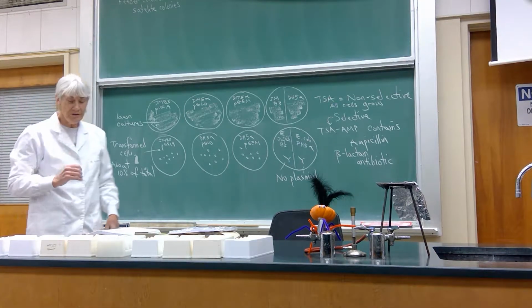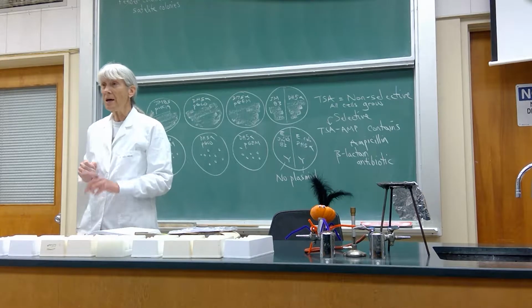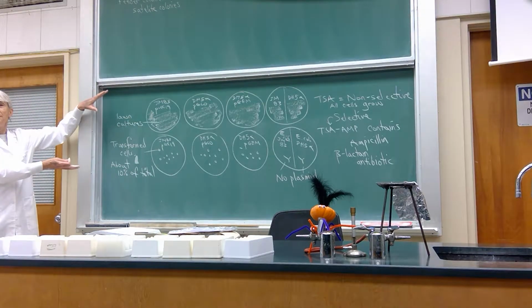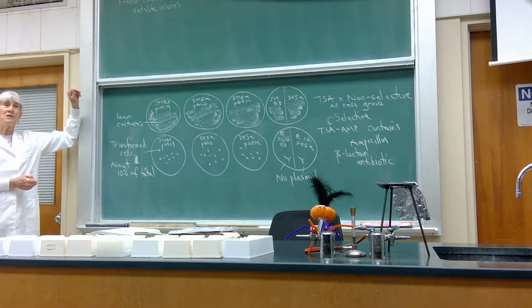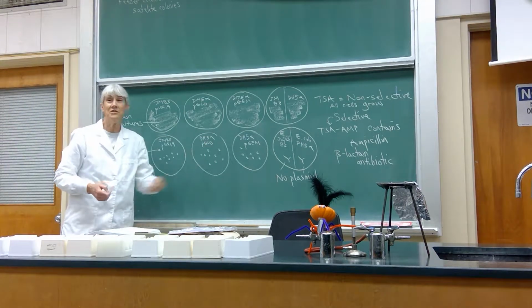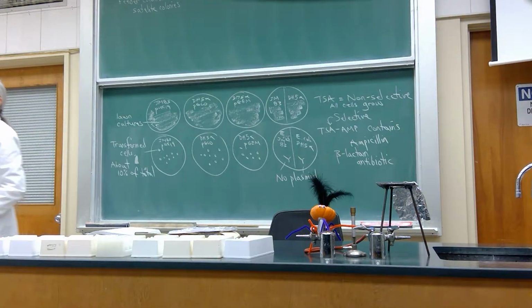Now, there's more to this exercise because there was another plate. But are you all following me so far and what this data shows us, and whether you were successful with your transformation or not? So supposedly about 10% would be a bunch of colonies. If you have only 1, I'd say your transformation efficiency is significantly less than 10%. But hey, it worked. If it's 1%, it doesn't matter. It's there. So that's all you need.